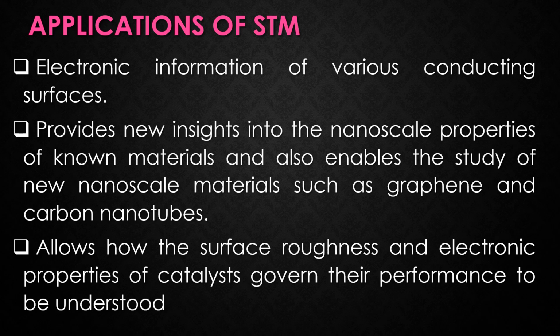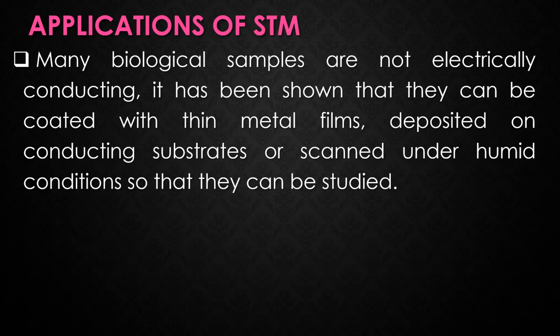In chemistry, the scanning tunneling microscope allows how the surface roughness and electronic properties of catalysts govern their performance to be understood. And finally, many biological samples are not electrically conducting. It has been shown that they can be coated with thin metal films deposited on conducting substrates, or scanned under humid conditions, so that they can be studied using scanning tunneling microscopy.